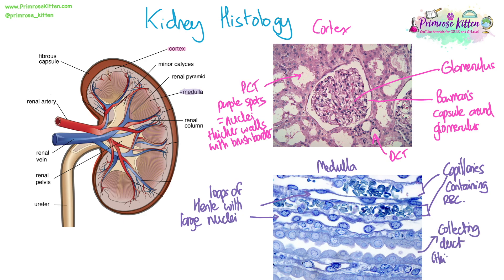Then we have a collecting duct, which you can tell is different from the others because it has much thicker walls. The capillaries have very thin walls — you can barely see them — and you can see the red blood cells inside with their classic biconcave shape. The collecting duct has thick, bumpy walls where nuclei are visible in some cells. The loop of Henle has thinner walls than the collecting duct, with large nuclei that stick out into the lumen.